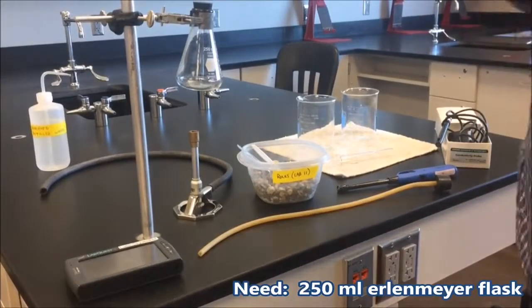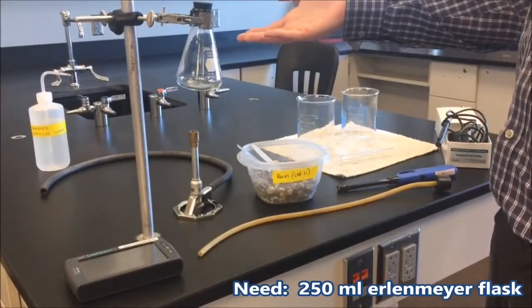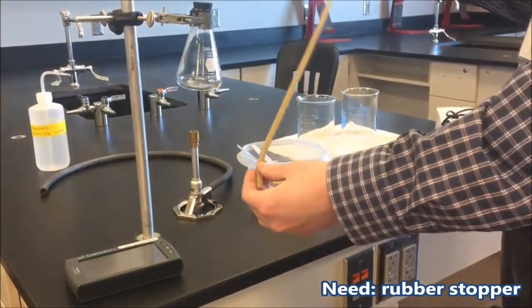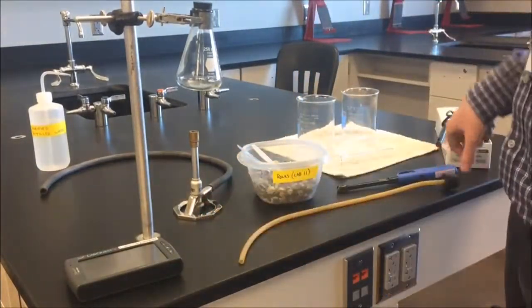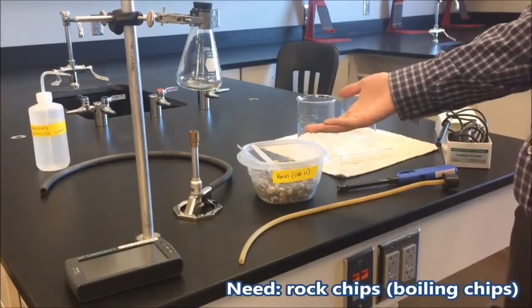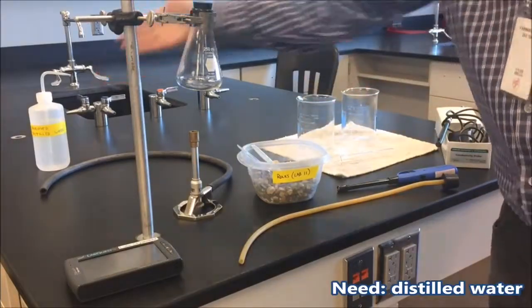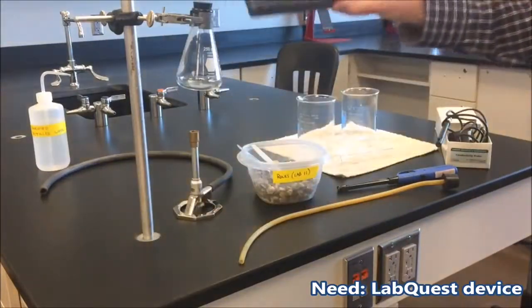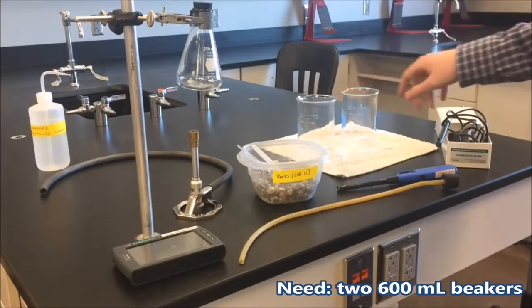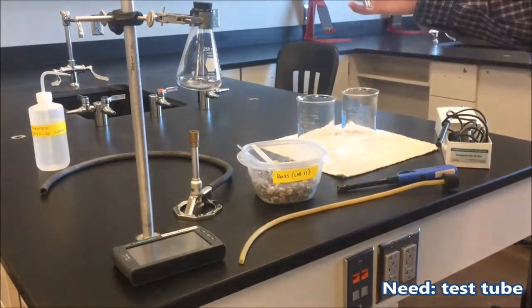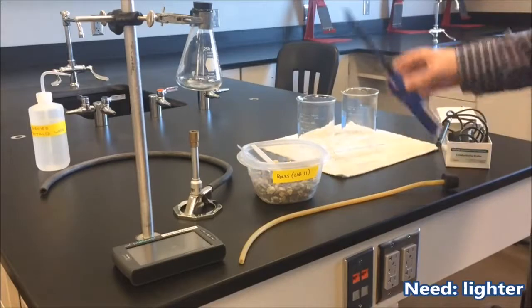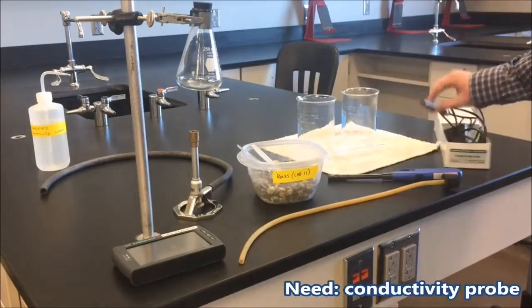For this lab we'll need a 250 milliliter Erlenmeyer flask, a Bunsen burner, a rubber stopper that we'll use for the Erlenmeyer flask while the procedure is running, rock chips or boiling chips, distilled water, our LabQuest device, two 600 milliliter beakers, a test tube that we'll be distilling our fresh water into, a lighter, and a conductivity probe.